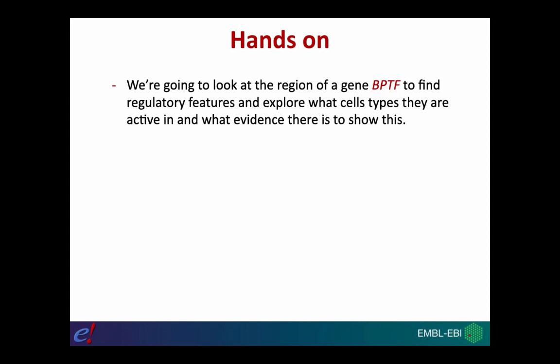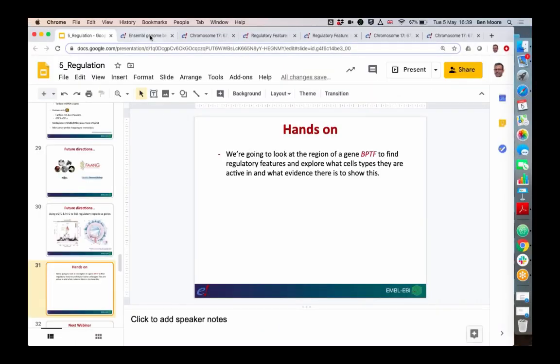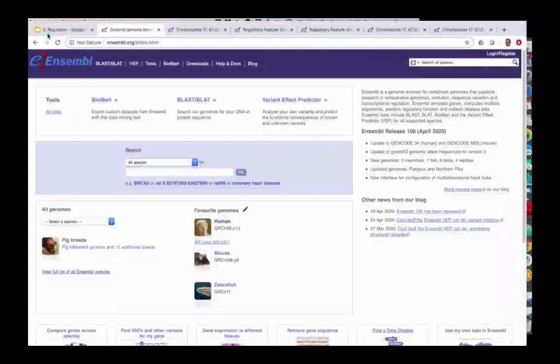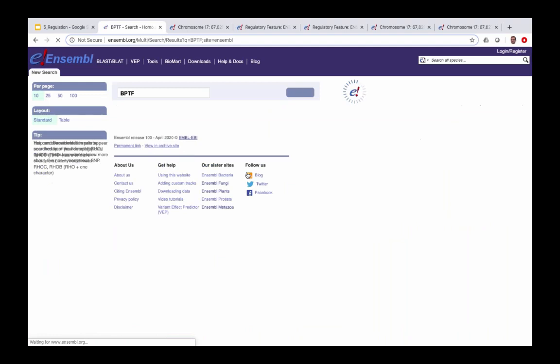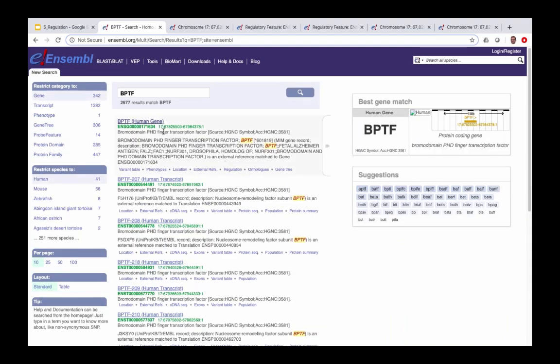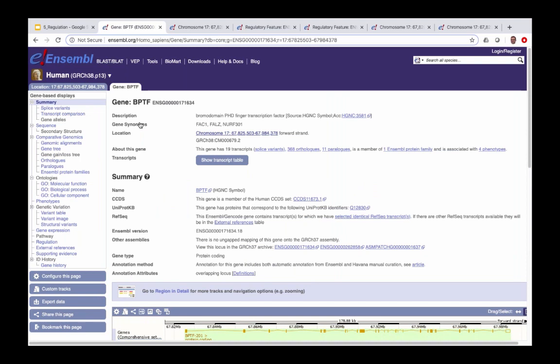In the demonstration, we want to look at a region of the genome where a gene of interest is found — the gene BPTF. From the Ensembl homepage search bar, I type BPTF and click Go. From the search results, I click on the link for the BPTF human gene, which takes me to the gene tab.